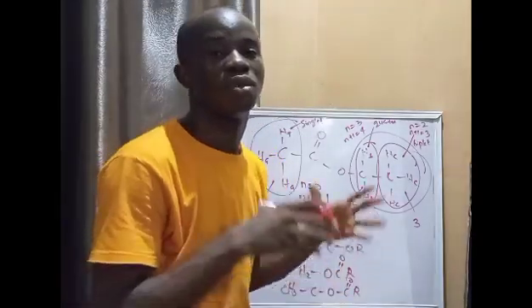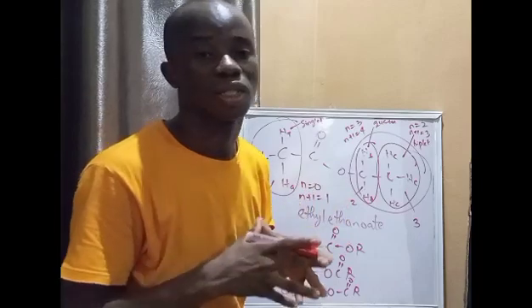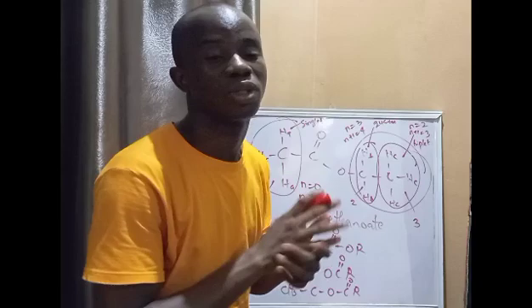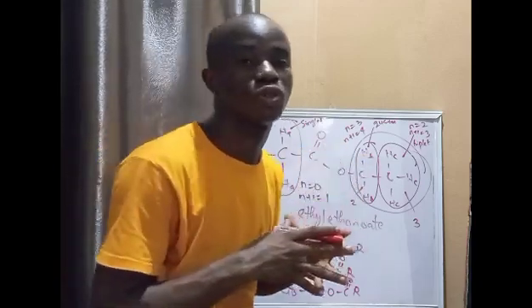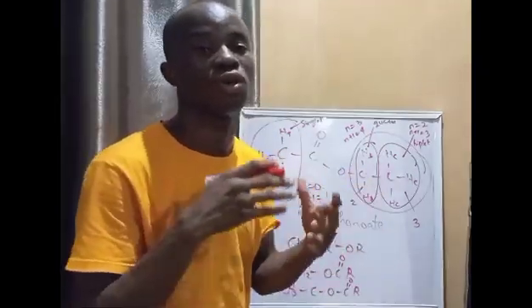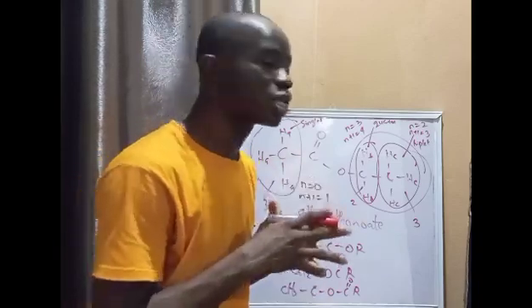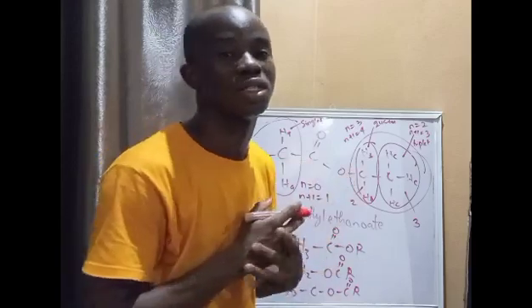At the same time, in the subsequent video, I will also try to bring an example of a question whereby the different spectroscopic techniques that we have talked about, which include the UV, the infrared spectroscopy, the mass spectroscopy, and the NMR, are combined for elucidation of structure or for prediction of structures. And that will also further help our understanding of all what we have learned so far.